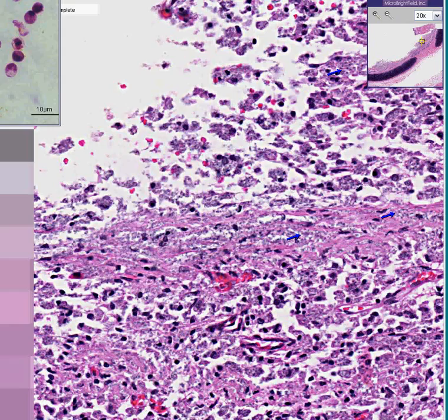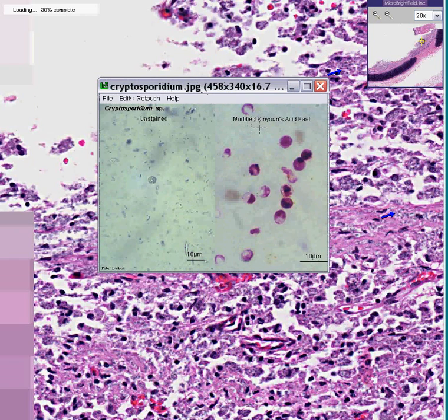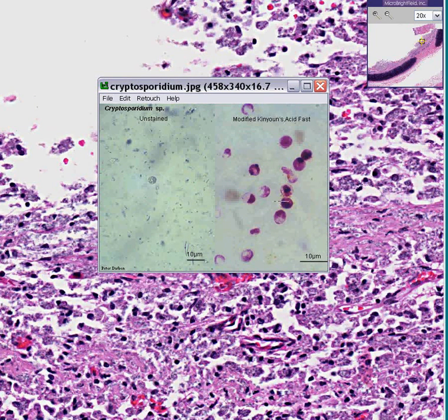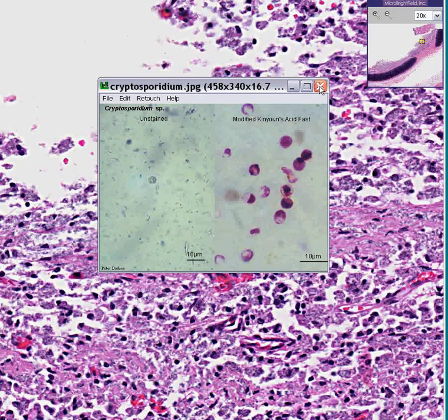This is a modified Kinyoun's acid-fast stain, and here you could see the organisms much better. If this scale is 10 microns, these organisms are about half the size — roughly five microns, almost the size of a red blood cell. Cryptosporidium is a parasite — it's a protozoan.